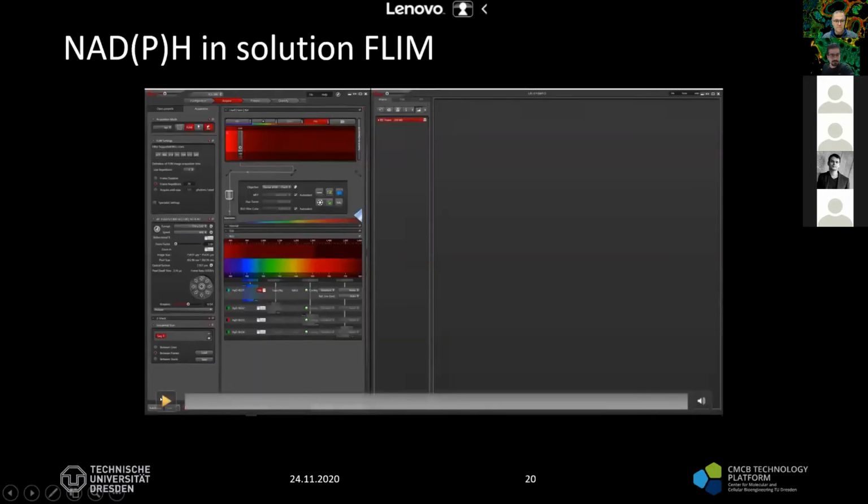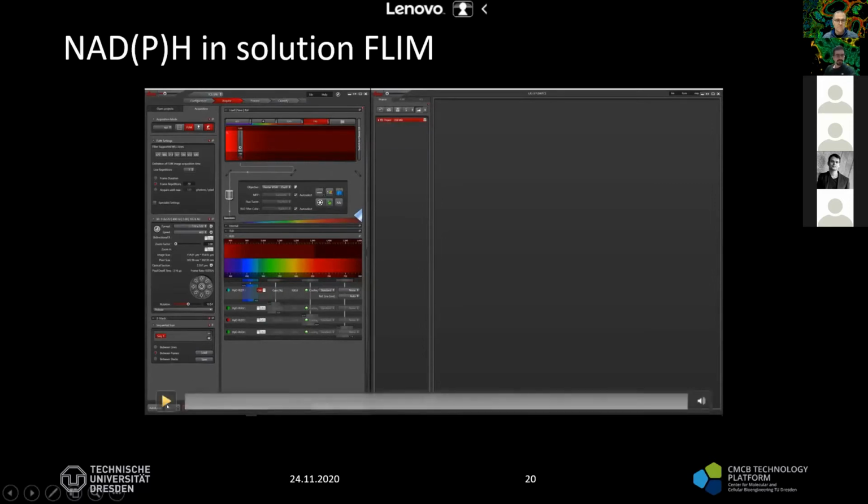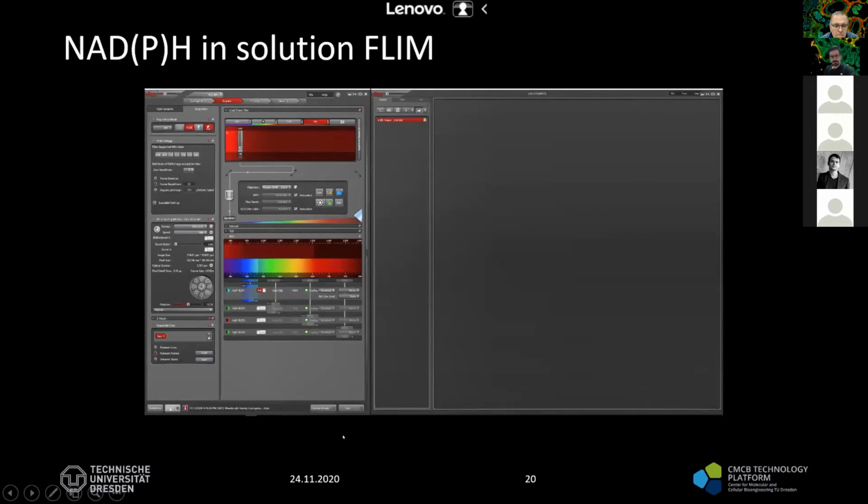That's done. And here is a video from when I measured NADH. It actually doesn't have NADPH in that solution. It's only NADH. And let's see. It's supposed to maximize when I play it.